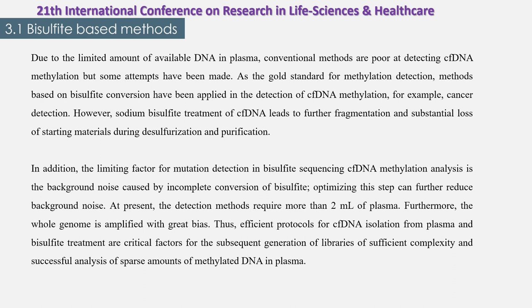bisulfite treatment of cell-free DNA leads to further fragmentation and substantial loss of starting material during desulfonation and purification.